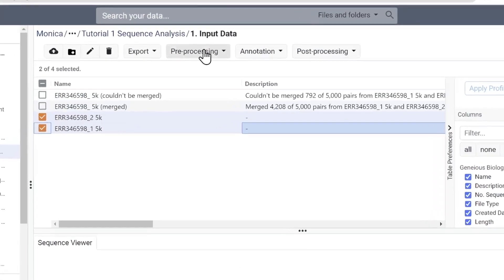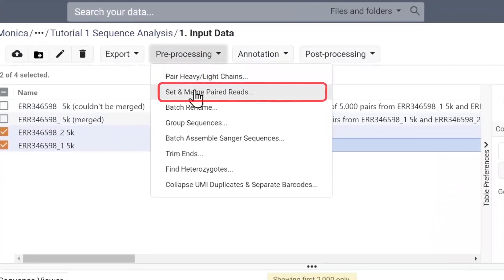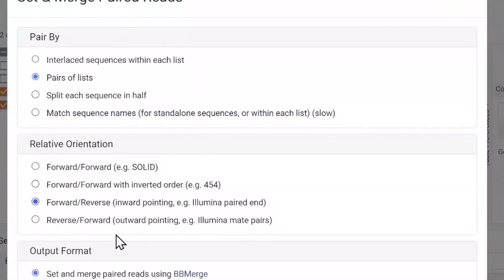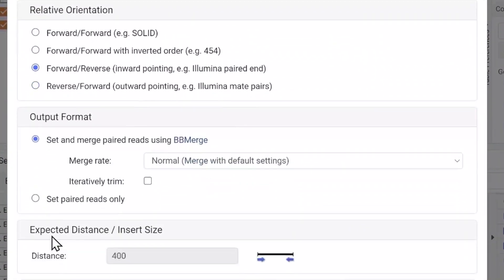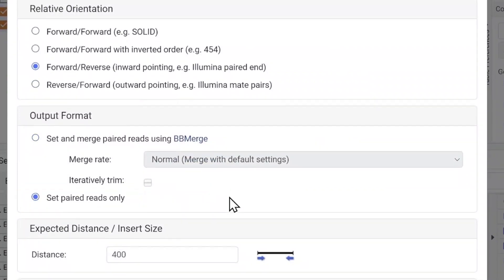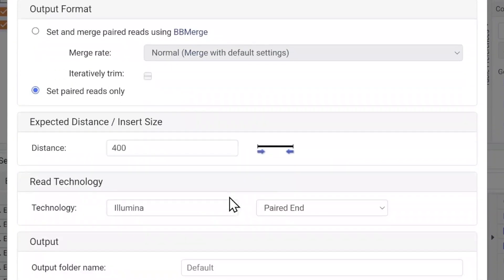We could also choose to pair reads without merging and annotate the sequences, keeping in mind that they may not be complete antibody sequences.